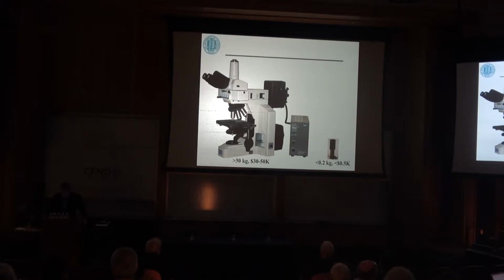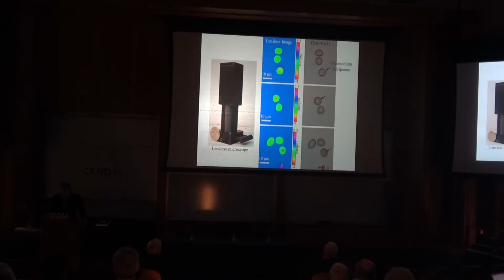So just a comparison, it's a very lightweight interface, as tall as your iPhone, maybe 200 grams, very inexpensive to put together because it's benefiting from economies of scale. CMOS imagers obviously are a few dollars because of the large volume of our smartphones. And the rest is just LEDs and simple fiber optic cables put together. These are some earlier images of how this kind of microscope is working. This is a very early generation CMOS imager, 5 megapixel.